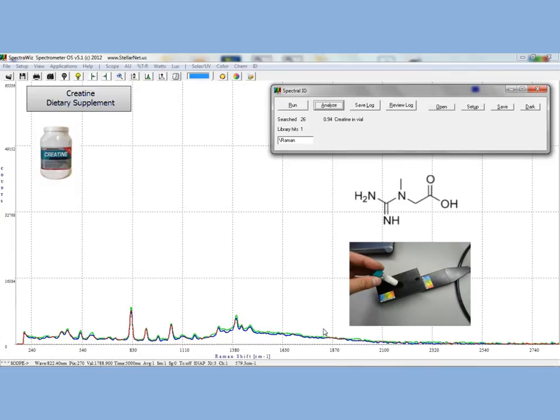By clicking on the library match, creatine in a vial, we can see the spectral overlay of the library spectrum and the experimental spectrum.